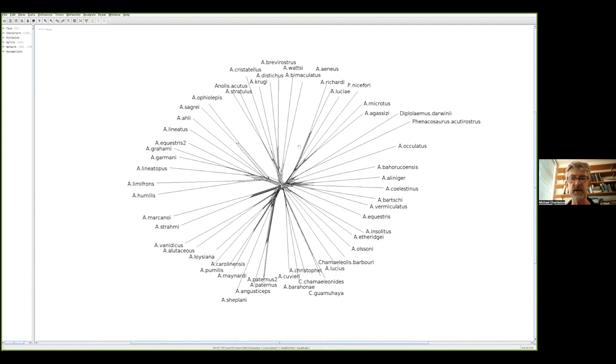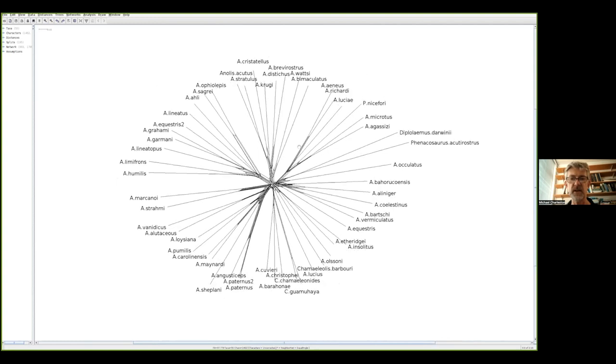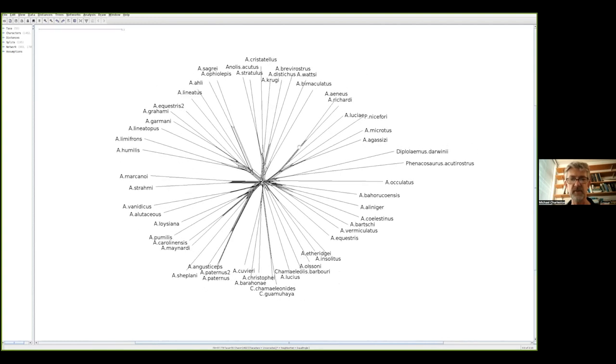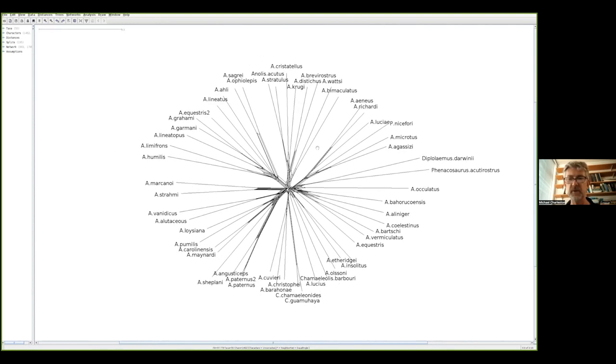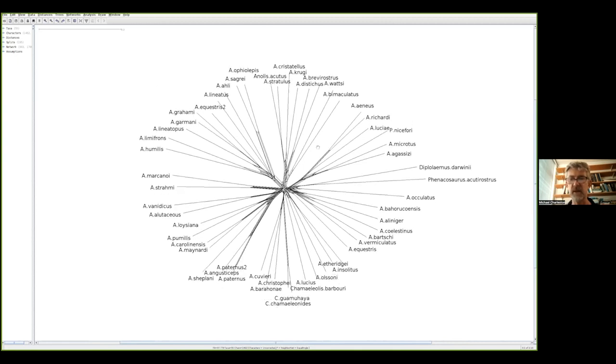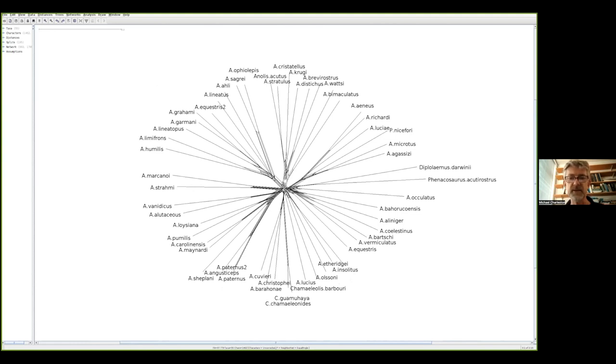I'm going to try and adopt a consistent orientation for this particular network, this particular dataset with my outgroup species over here on the right.